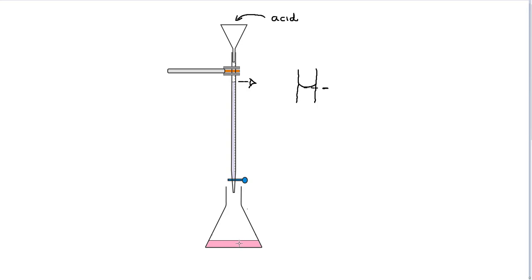It'll be quite a rapid change, and as soon as that changes from pink to clear you take note of the new level of the acid. Here you can see that the acid has been added to the alkali and the indicator has suddenly changed color from pink to transparent. This isn't blue, it's clear. What we then do once that has happened - we know that the acid has exactly neutralized the alkali in the conical flask.